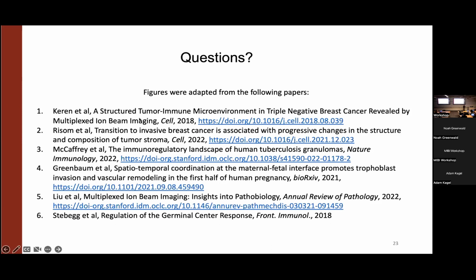So you're going to have to think about how that would fit into generating the null distribution. If you want to use the exact same way it's done here, which means just taking things and permuting them to the locations of the other labels, then you would need to boil all that down to having one label per location that is permutable, and you can then use it out of the box. But if that doesn't make sense for generating the null distribution, you're going to have to make some changes.